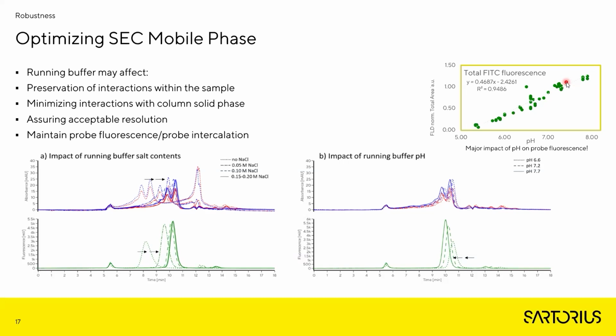As the conditions within the method are normally well controlled, the sensitive probes might cause variation in the results between the different sequences and sets of analysis in case of variations in buffer preparation, or let's say ambient temperature if we are using temperature sensitive buffers.